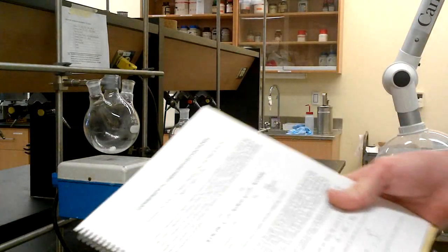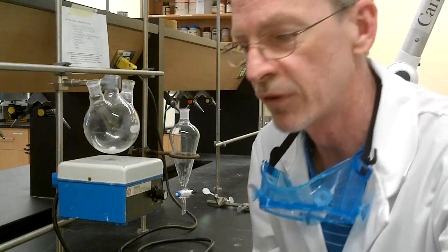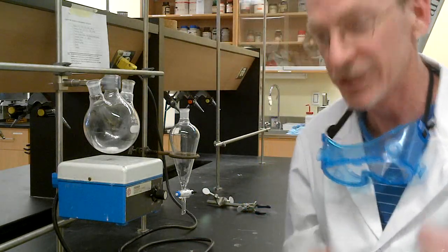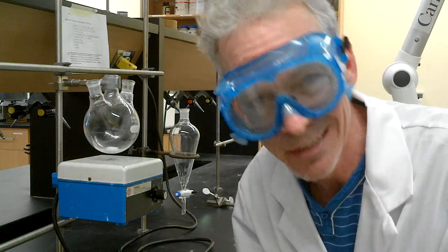Welcome back. Experiment number nine, the oxidation of 2-octanol. Fairly straightforward reaction. It's an oxidation, obviously. So we're going to be using bleach to oxidize the alcohol to a ketone.